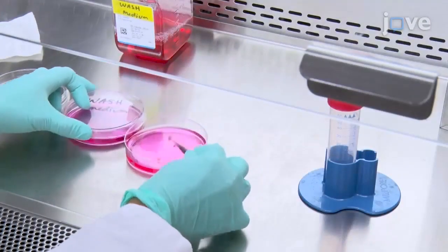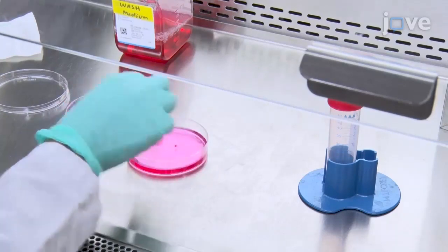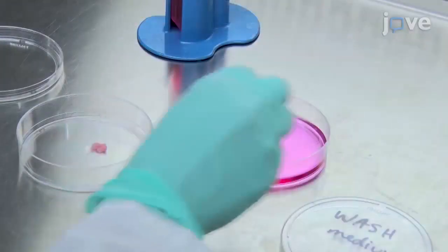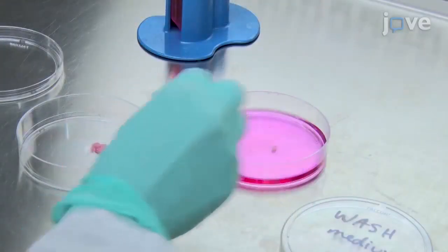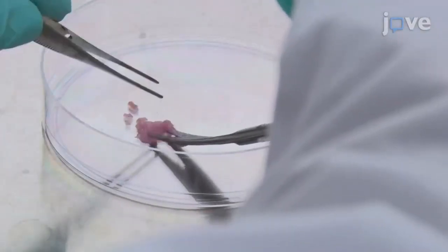Incubate the tumors in wash medium prepared according to manuscript directions for 15 minutes. Then transfer them to a new dish and mince them to less than 1 mm pieces using sterile curved scissors.